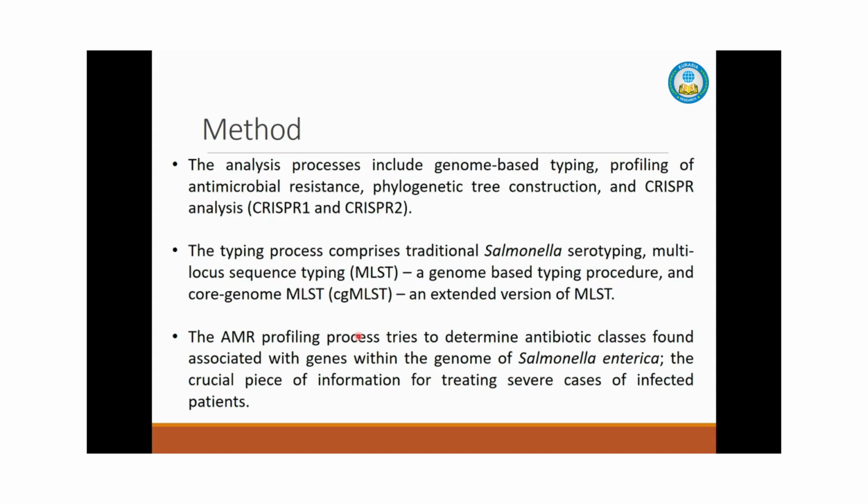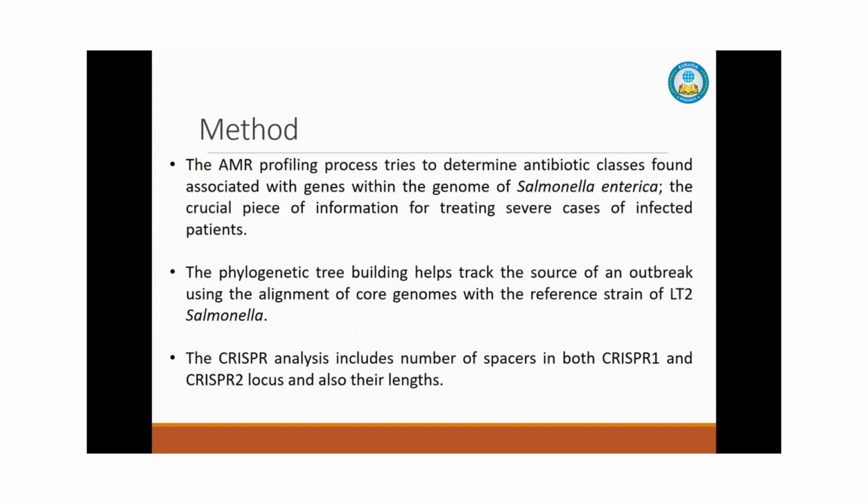It will tell you the antibiotic class and also the antibiotic genes that the genome of one particular serotype has. So the AMR process determines the antibiotic classes associated with genes within the genome of Salmonella enterica.